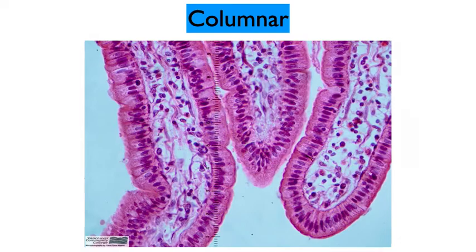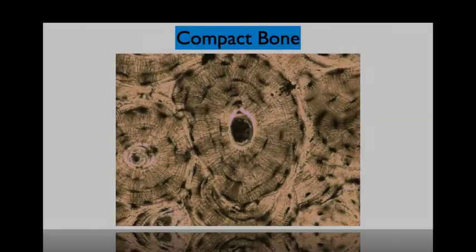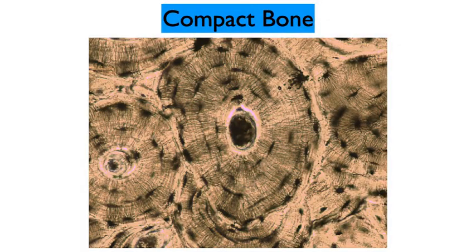Okay, now moving on to connective tissue. There are various connective tissue samples that you viewed. One in particular was bone. And here you see in this slide a very iconic depiction of bone. You can see that we have, looks like, 3 or 4 osteons or haversian systems, either wholly or partially depicted in this particular slide.